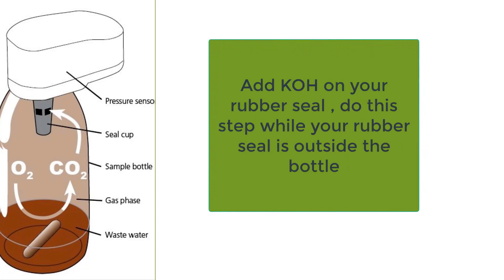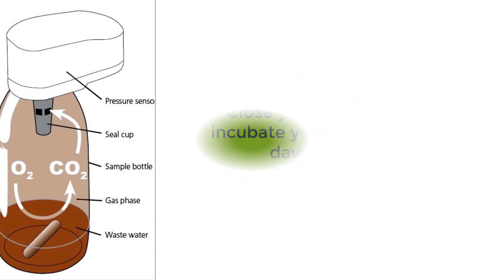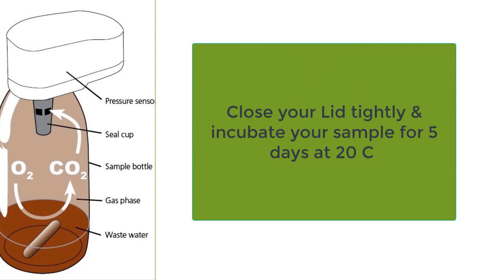Next, add KOH — potassium hydroxide — on your rubber seal. Do this step while your rubber seal is outside the bottle, to avoid getting potassium hydroxide inside the bottle, which would give you a wrong result. Then close the lid tightly.